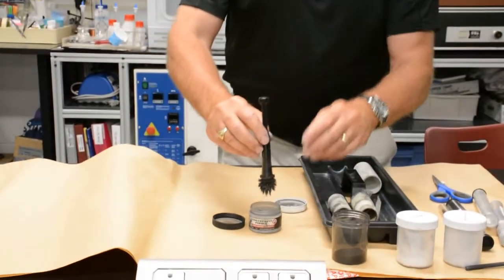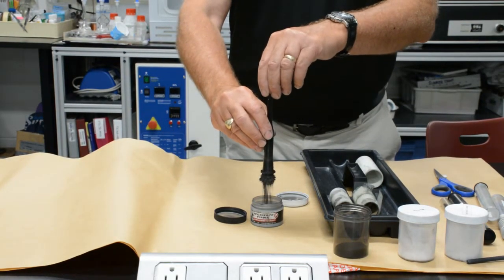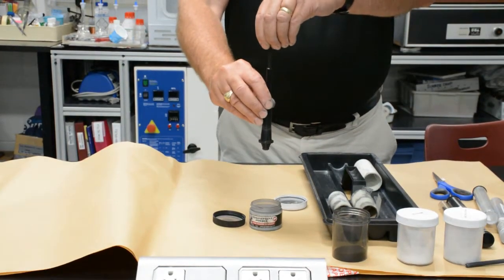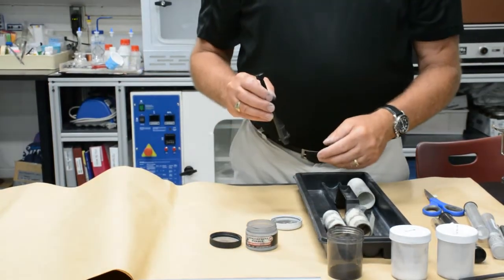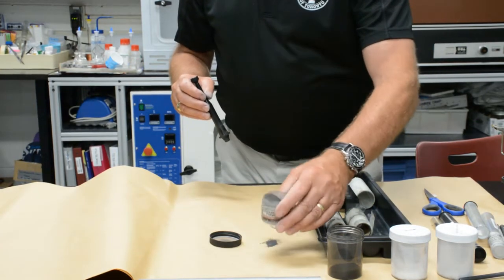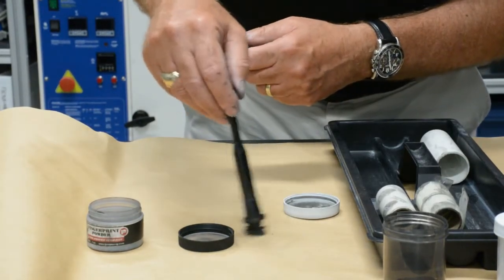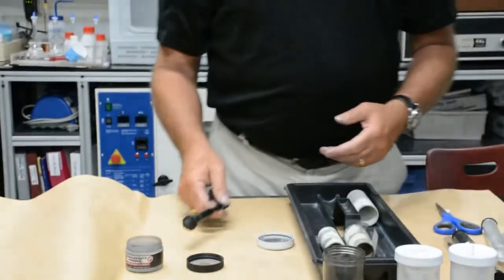Now, that can be used as a brush, and we're going to demonstrate it momentarily, but you can also reclaim the powder by demagnetizing the tip, by lifting the shaft and probe up so that the magnet is now not making contact with the bottom tip, and it demagnetizes and reclaims the powder. I'll just do a quick demonstration as to how that powder can be recovered off the surface. If you have excess powder present after you've examined the scene, you simply remagnetize the tip and brush lightly over the surface to reclaim any excess powder and reinsert it into the jar.